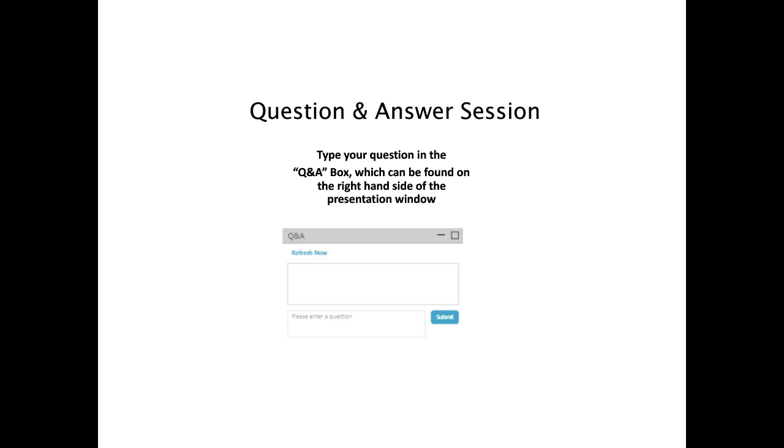Yes, it does. We haven't talked a little bit about universal calibration, but in the early days of chromatography, calibration methods were basically the only way to use it, where you correlated the elution time through the column to a molar mass. That's standard calibration. Or you could do universal calibration, where you use both the viscometry and the elution time to get molar mass.